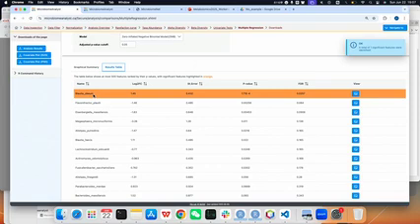Like the pattern, the microbiome might not quite separate between the groups, but there are always some features underlying the signal that make sense.